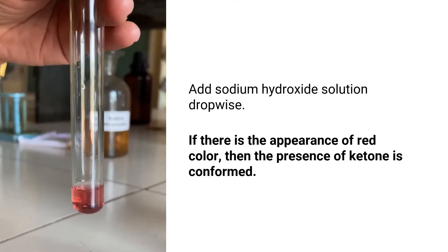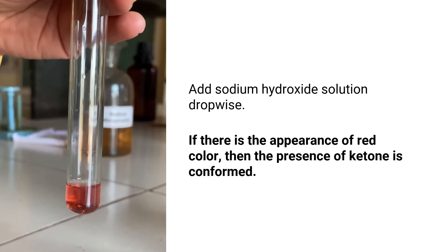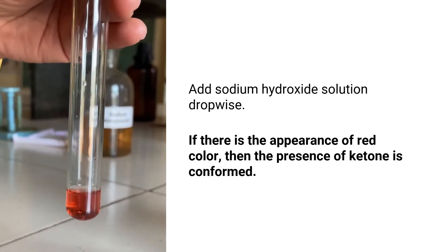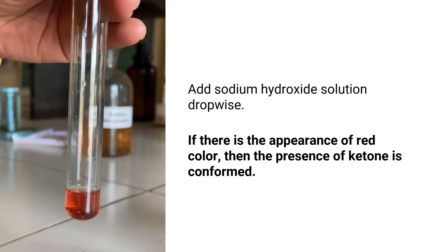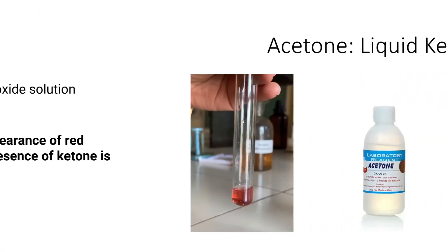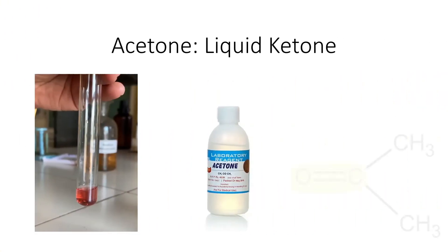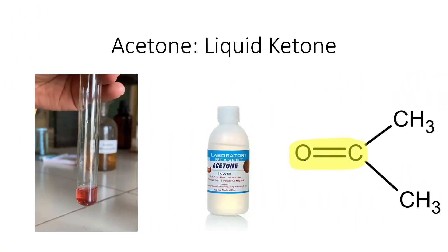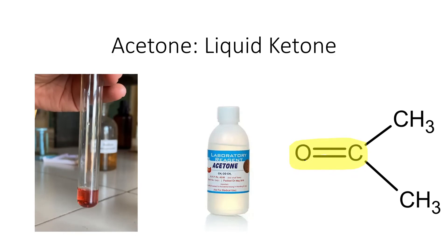Formation of red color confirms presence of carbonyl group. As acetone contains a carbonyl group, we observed red coloration.